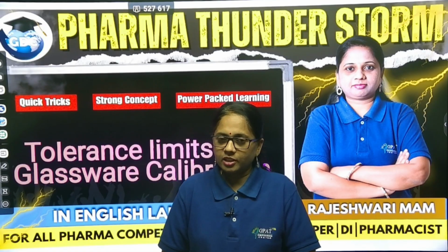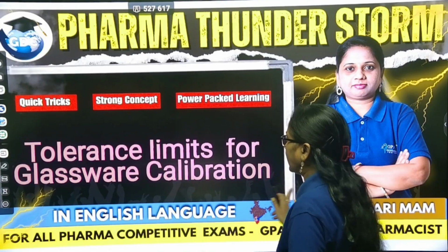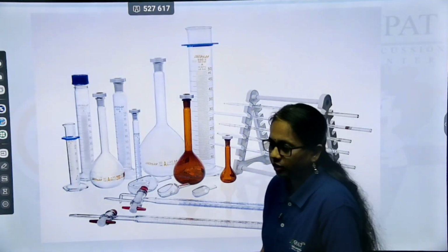So let us start our today's session in our Pharma Thunderstorm series, the tolerance limits for the glassware calibration.